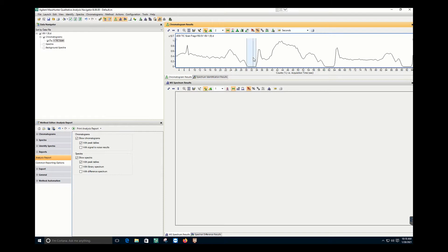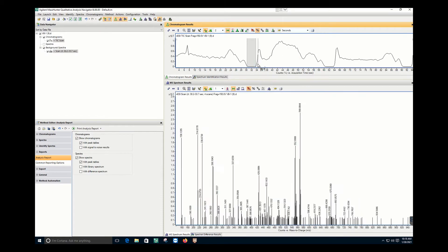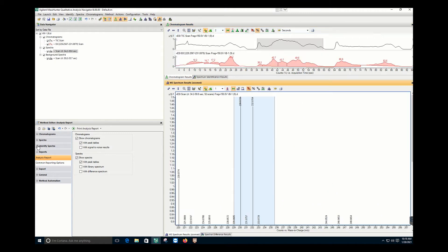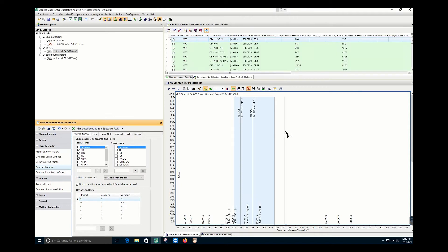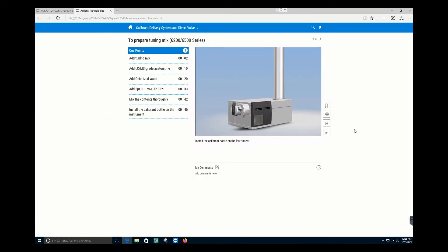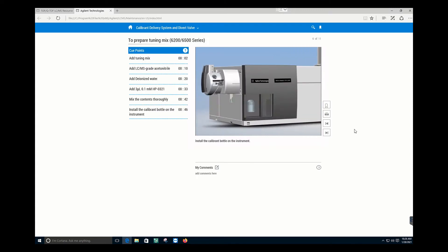Agilent Mass Hunter software delivers outstanding performance in all MS processes. The powerful mass spectrometry software package provides user-friendly instrument control, monitoring, and data analysis. Agilent also provides very useful resources files with nice features of animation guides for troubleshooting and instrument maintenance.